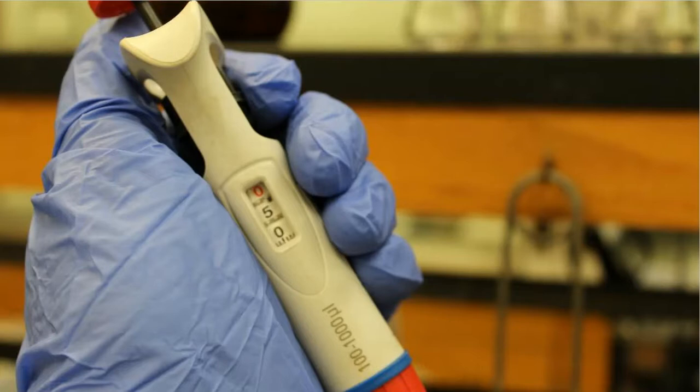So I've taken this micro pipetter that's 100 to 1,000 microliters, which basically means 0.1 to 1 milliliters. And I've dialed this in to 0.50. Well, for this micropipetter, it's a little weird. The 4th number actually comes from that tick mark, so this is another 0. So this is 500, which is 500 microliters, and 500 microliters is equal to 0.5 mils.